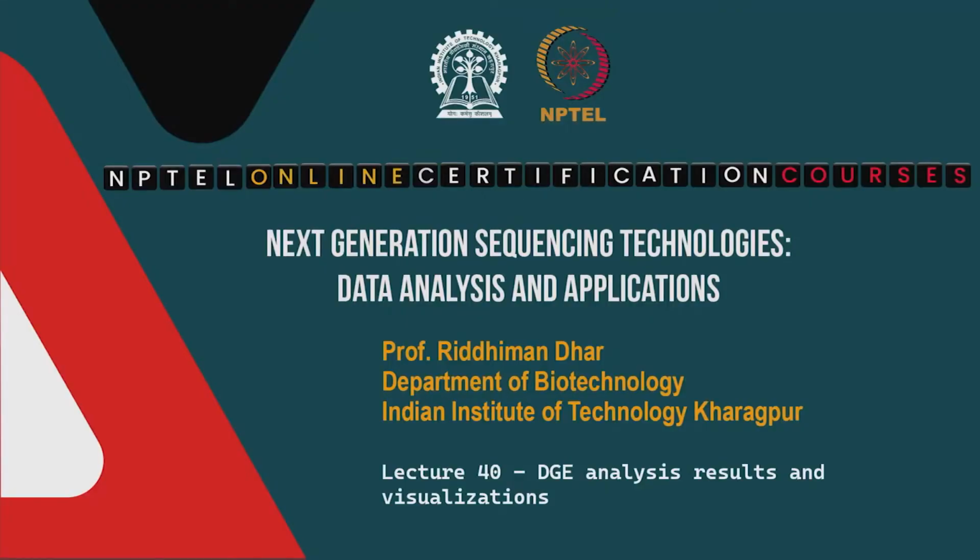Good day everyone, welcome to the course on next generation sequencing technologies, data analysis and applications. In the last class, we started discussing differential gene expression analysis, or DGE analysis in short. We talked about the preliminary concepts and we also started discussion on DESeq2. We completed some parts, about the steps that we need to do for DESeq2 analysis. We will continue that discussion in today's class.